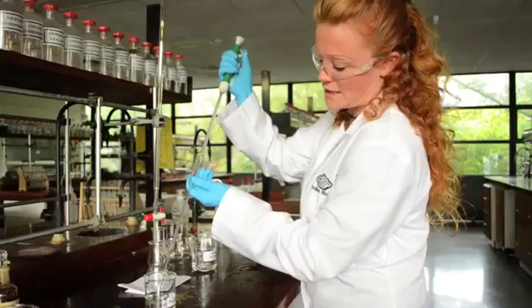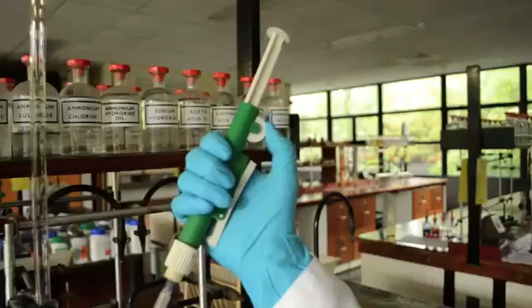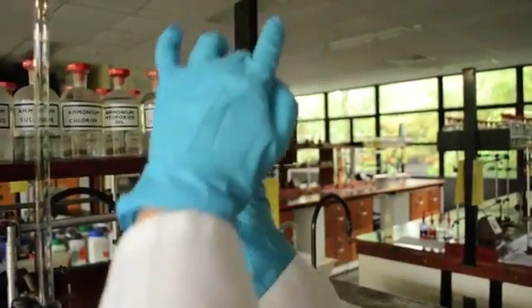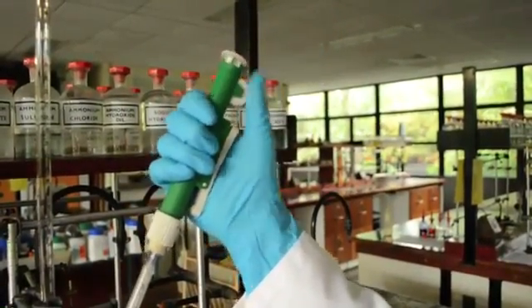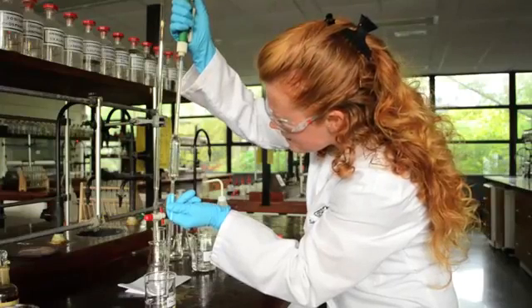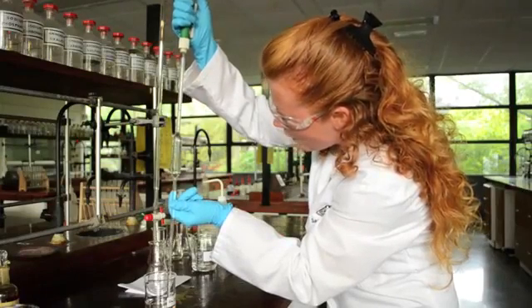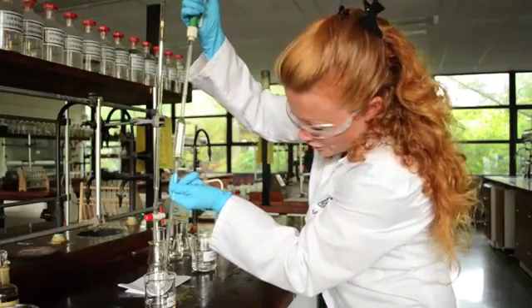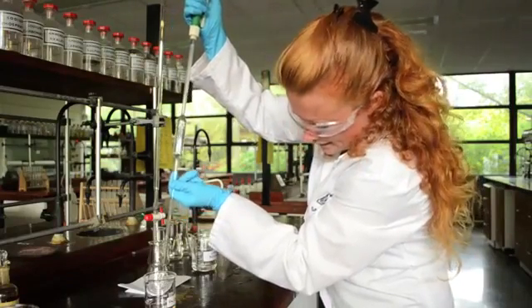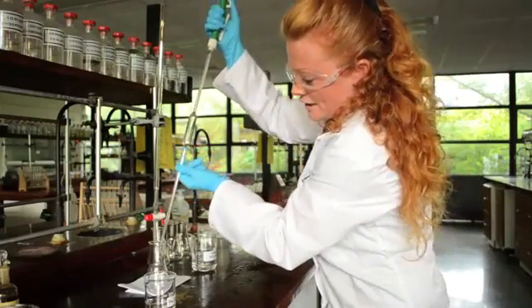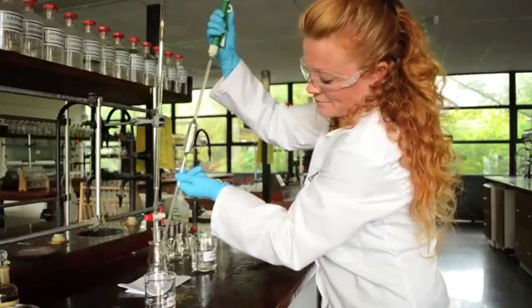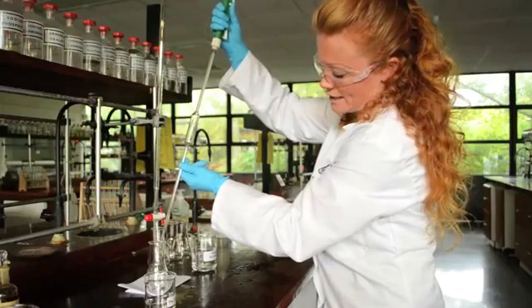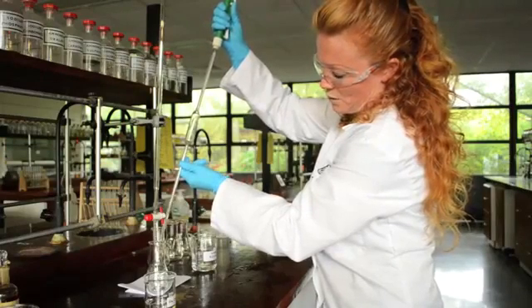I fill the pipette, like so, all the way up to the graduation mark, so that the bottom of the meniscus is sitting perfectly on the graduation mark at eye level. I'm going to make sure there are no bubbles in the pipette, and then I'm going to transfer to the conical flask, like so. The conical flask has been rinsed out with deionized water prior to this transfer.